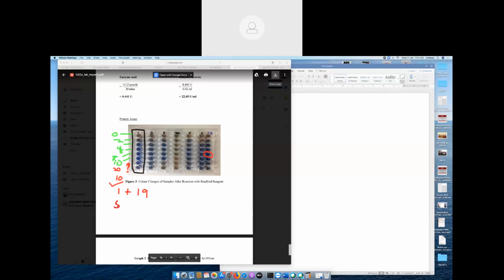You can put 5. If you put 5, you should put the distilled water 15, because you want to make it the total volume. So later we will divide with the volume of the sample that you have taken. You will multiply this so that you get the 20. Whatever happens, we are adjusting this volume of the sample so that it will match with the concentration that we have in the standard.